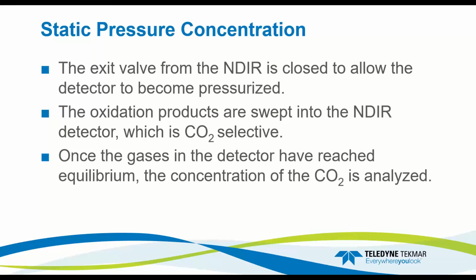Once that detector or the system has reached equilibrium, typically around 50 psi, we're taking a snapshot of the CO2 and it's being analyzed directly. So it's one instantaneous reading of a very sensitive sample.